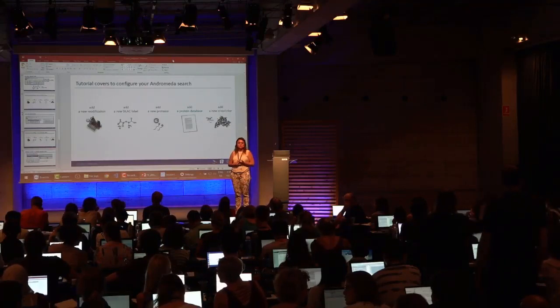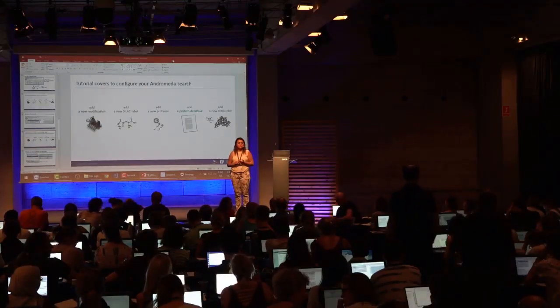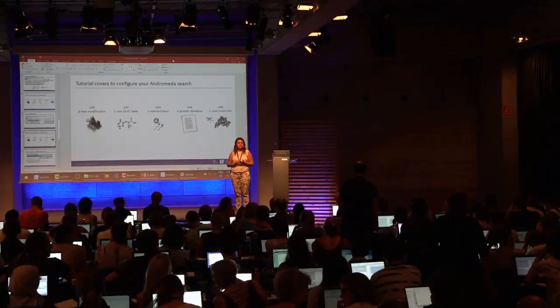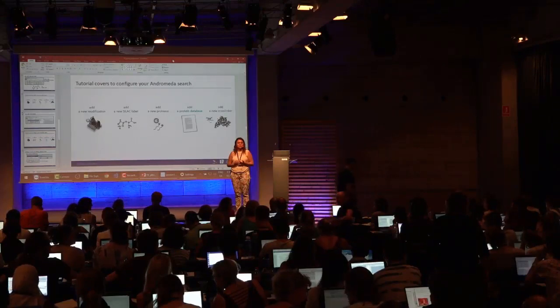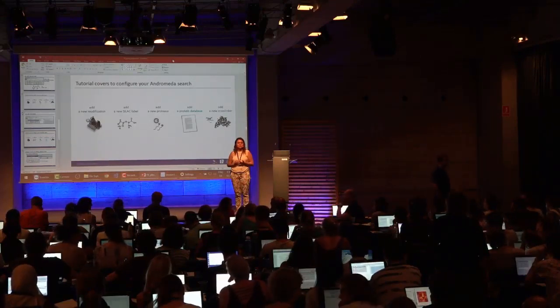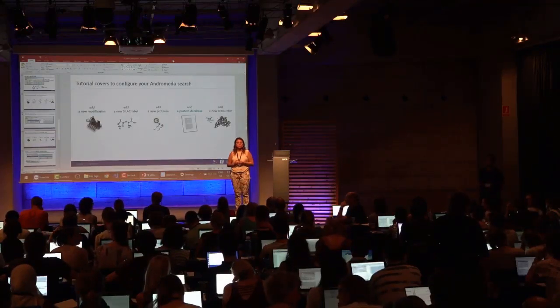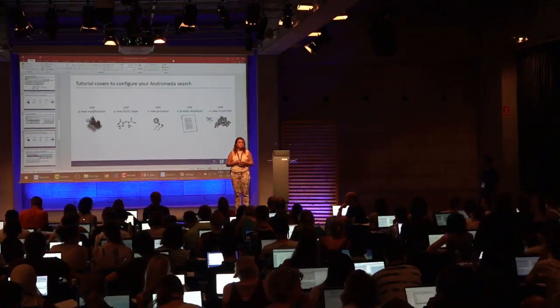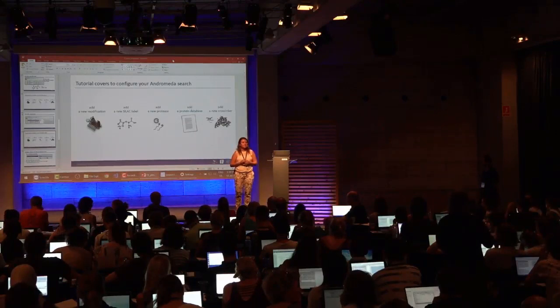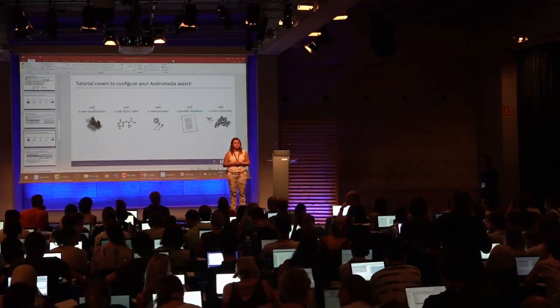I have a short question or suggestion. What about adding the identifying number from Unimod for searching in the table of modifications? It would sometimes make it easier if you search in Unimod and then search again in MQSS. This could have been an option. Yes, we will check. We will note this one for further improvement.